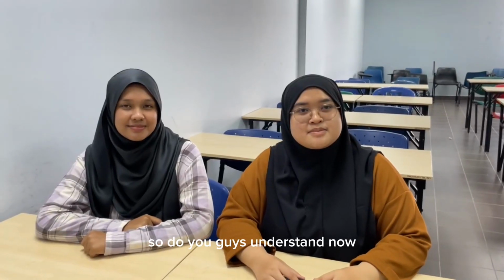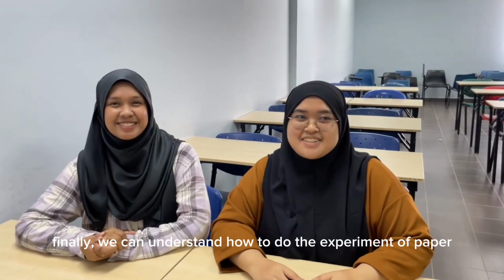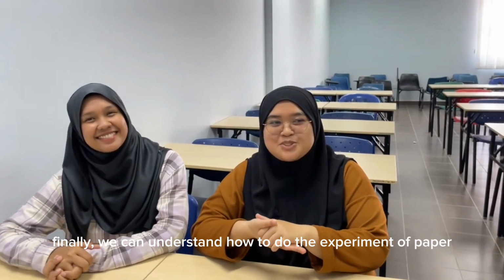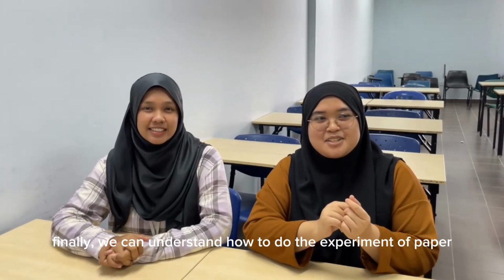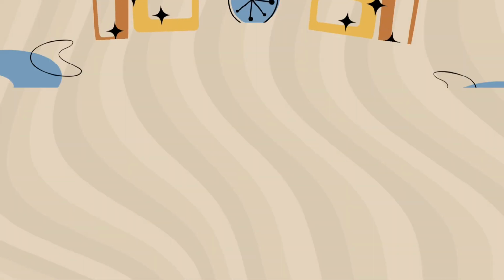So do you understand now? Yes. Thank you, Aimie, for the explanation. Thank you for teaching us. Finally, we can understand how to do the experiment of paper chromatography and how to calculate the RF value.